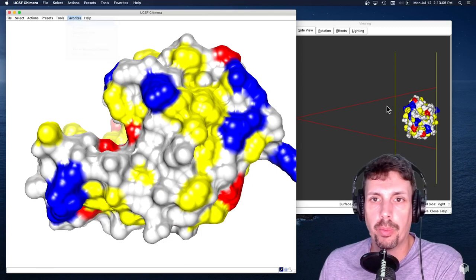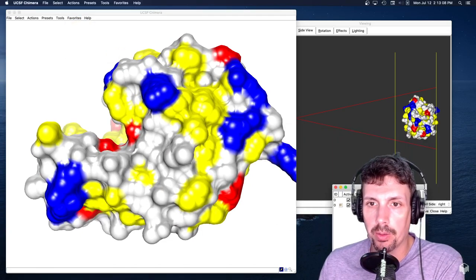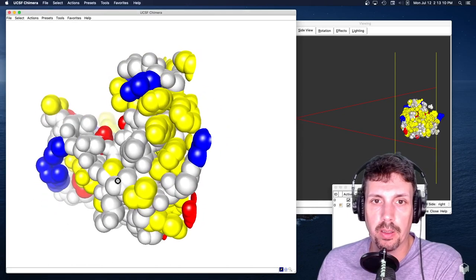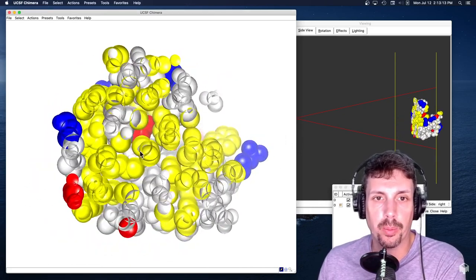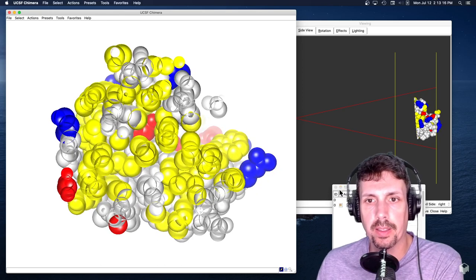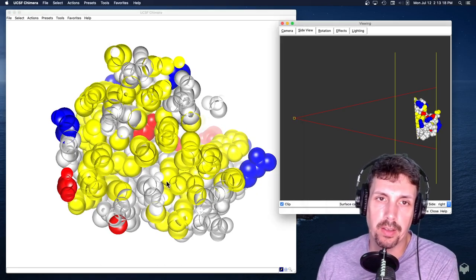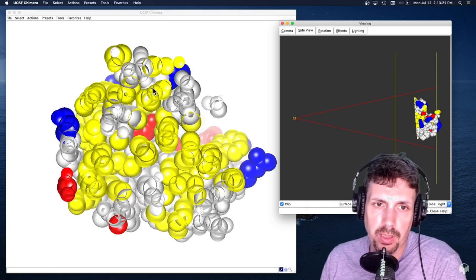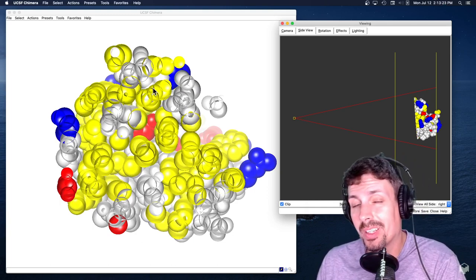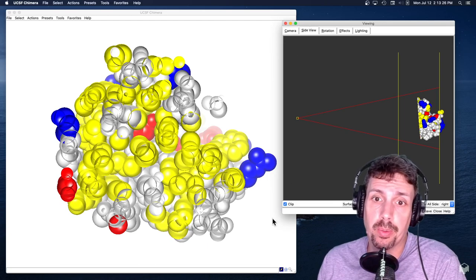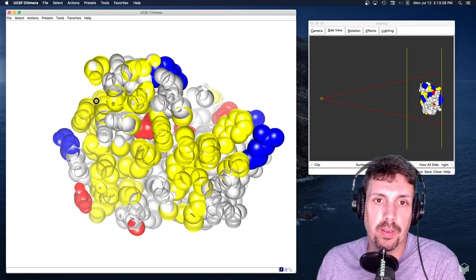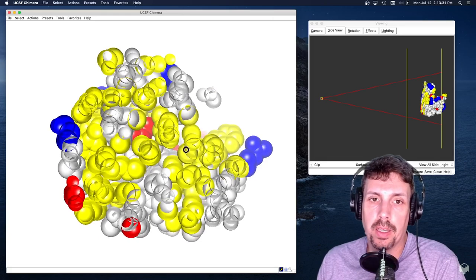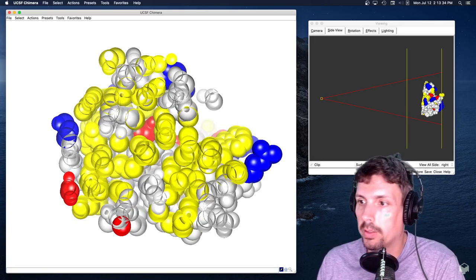I am going to go back to the model panel here. I am going to show the original atoms and hide the ones. I guess I need to open up that clip again. But this is the kind of picture I'm looking for here. Yes. It's going to have these ugly little circles because of how the atoms are sliced. But it is the one that gives us the most information. So. If you have a better way to do it, please let me know. I'd love to hear about it. But this is how I do the cutting the model in half using Chimera. So.